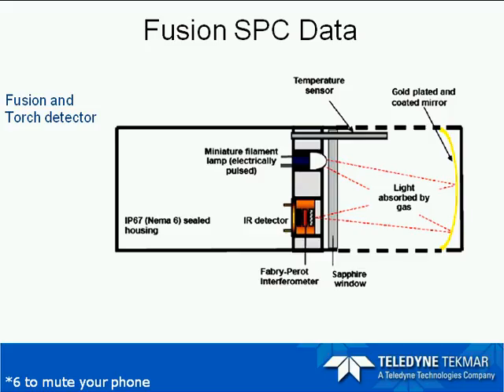Now, what happens for analysis: the IR light source electrically pulses two beams. It's important that you have a dual beam from a single light source, instead of two beams from two light sources as in flow-through cell detection on the Phoenix 8000 and Apollo 9000. So here you have a single light source producing two beams that traverse the sample cell.